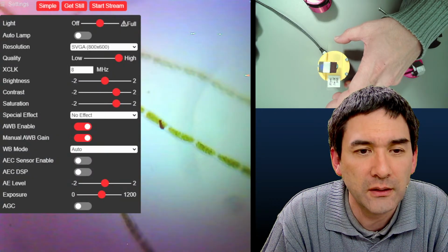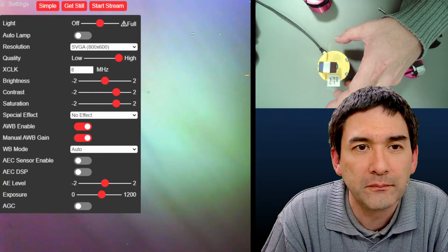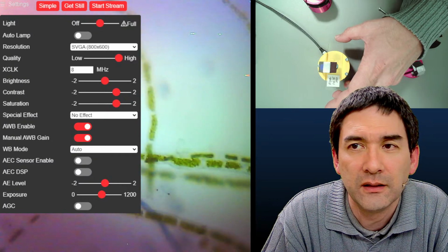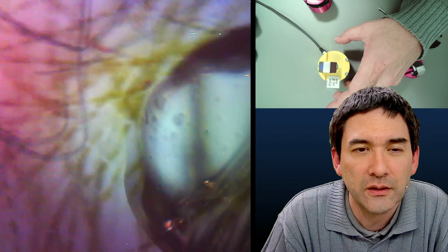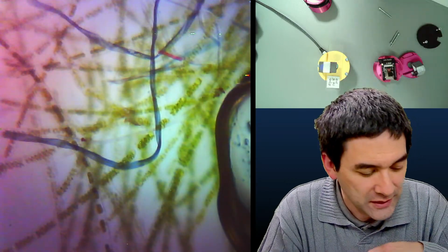Okay, this happens occasionally. Here we go again. Occasionally there's a little bit of a delay in the wireless transmission. Okay. Yeah. These are just some algae. Okay, you see also some fibers here, some microplastics. Okay, so this is basically one thing.